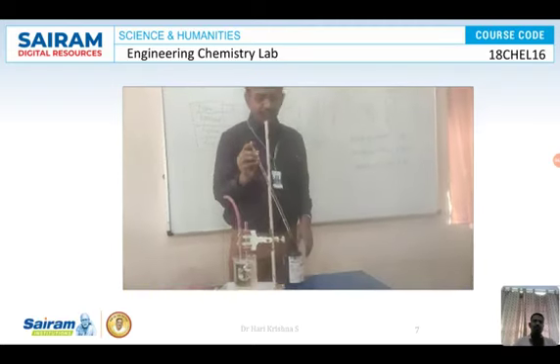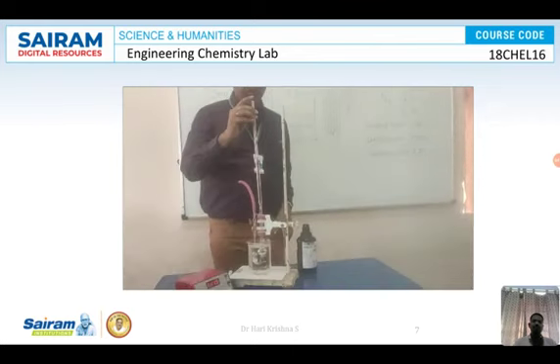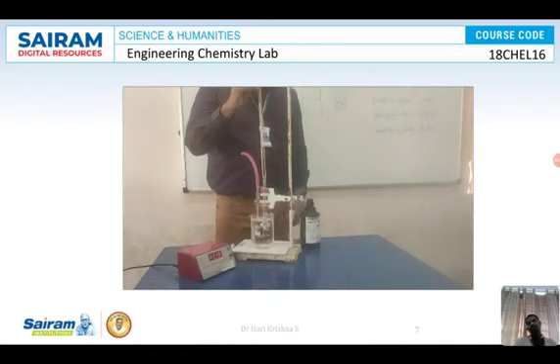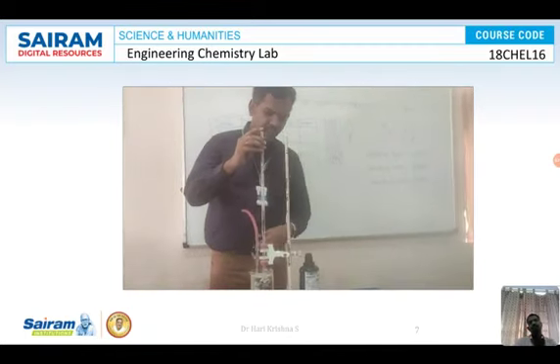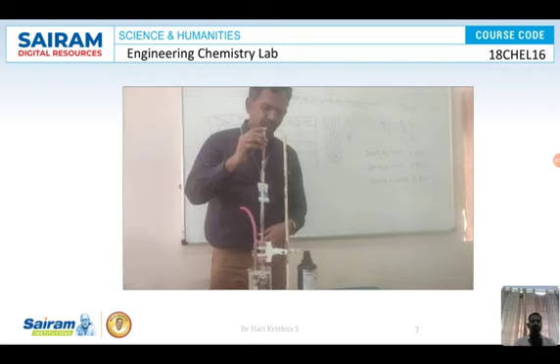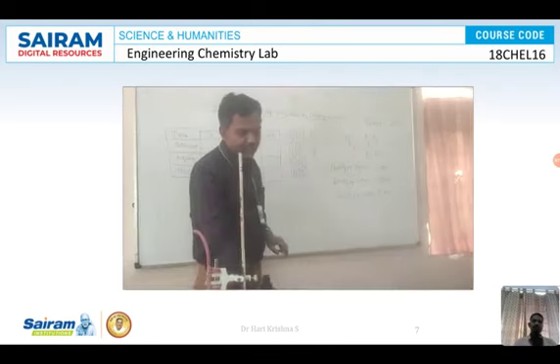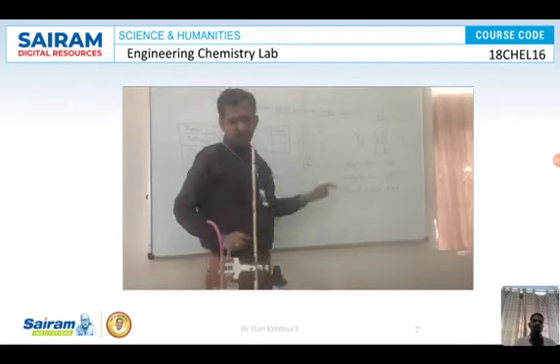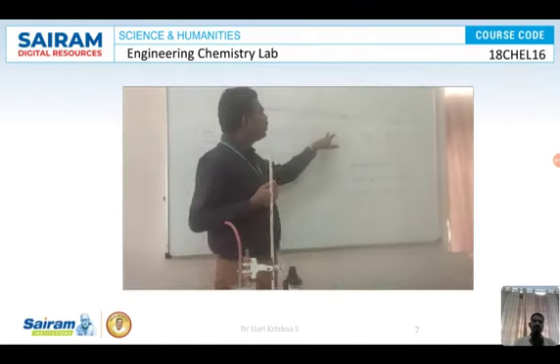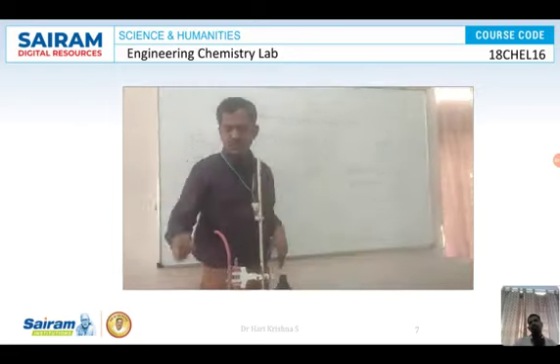So this organic liquid will be taken and put into the wide bulb of the viscometer. As discussed earlier, this viscometer has two bulbs, one lower bulb and one upper bulb. The upper bulb has two marks. We are going to suck the liquid using this rubber tubing from the lower into the upper bulb. I am going to pull the liquid above this mark and wait until the liquid crosses this mark. As soon as the liquid crosses this mark, I am going to stop.